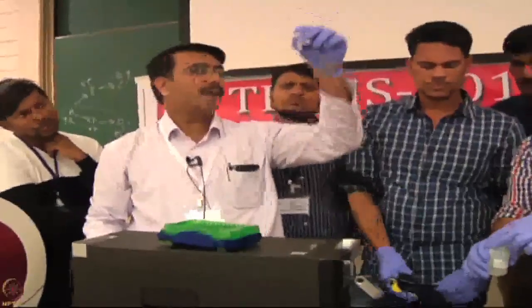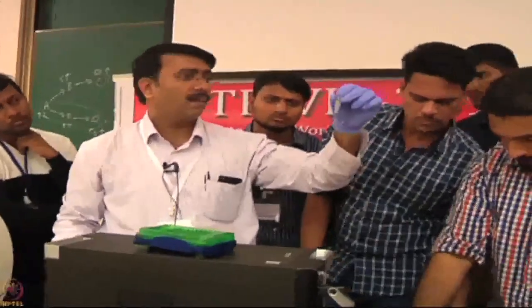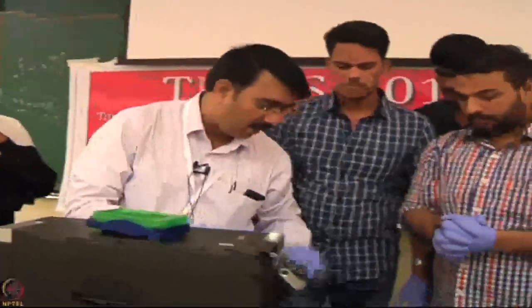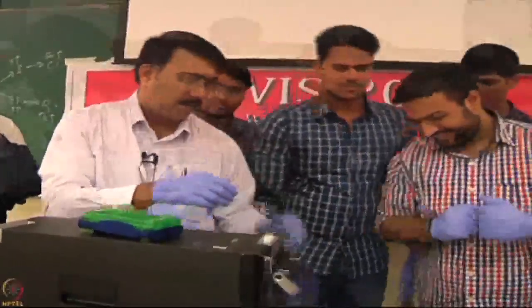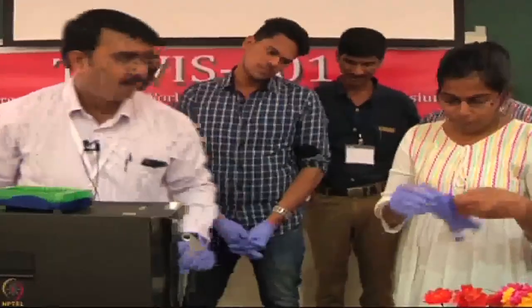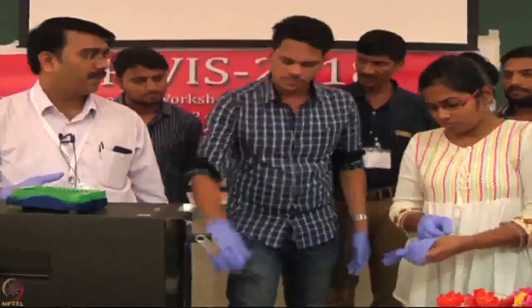Now I have protein A here, the biotinylated protein A, at 250 microgram per ml. Take around 15 microliter from this, then make up to 1500 microliter. So we should let others do it. Take around the 15 microliter, diluted to 1.5 ml.